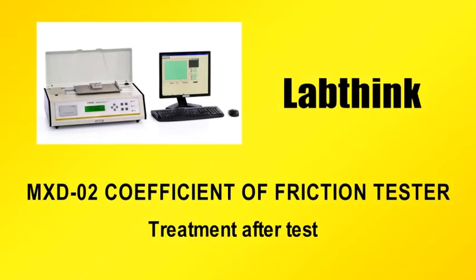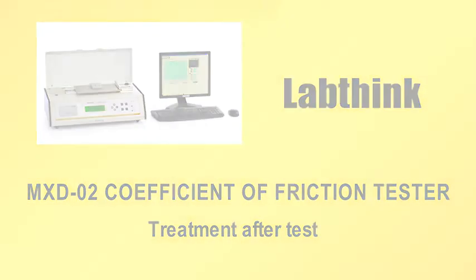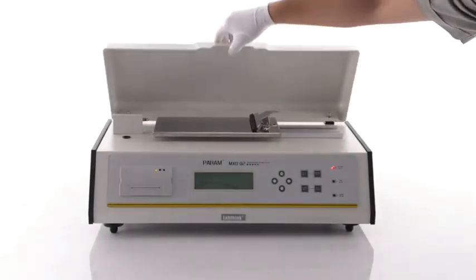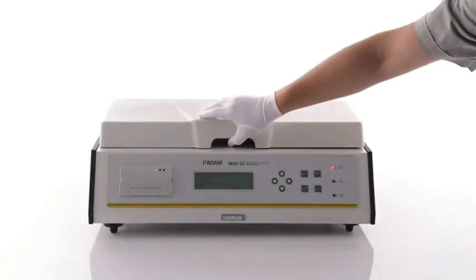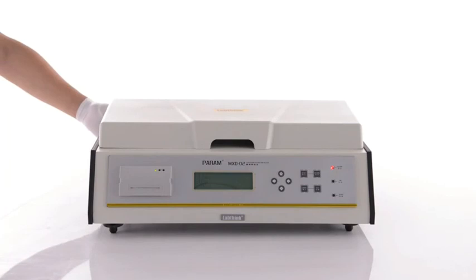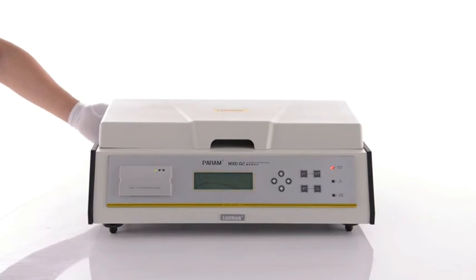Treatment After Test. Pull down the dustproof cover and switch off the instrument.